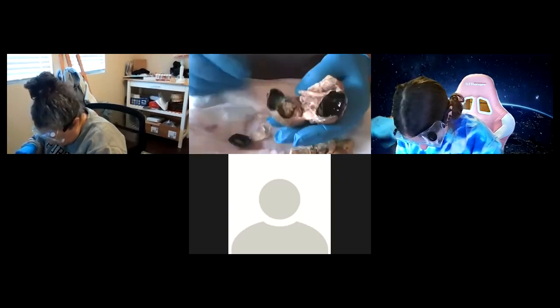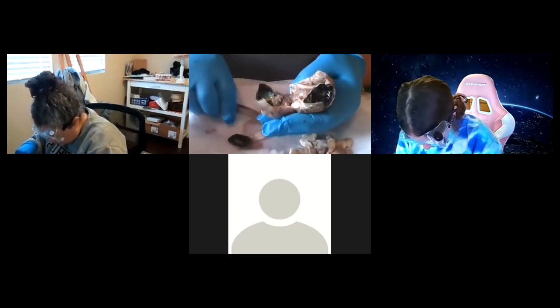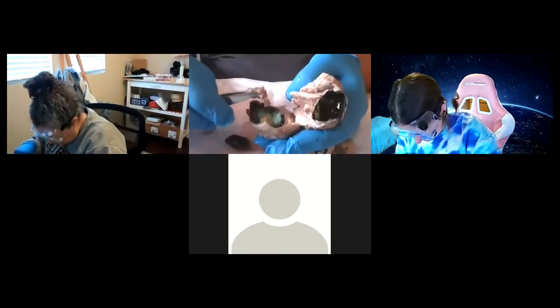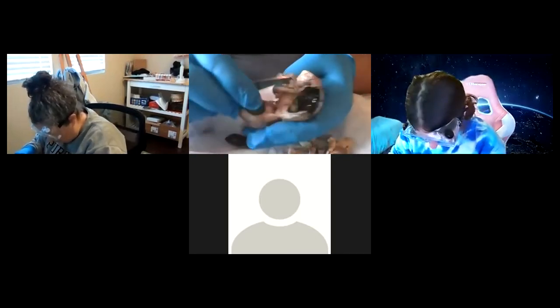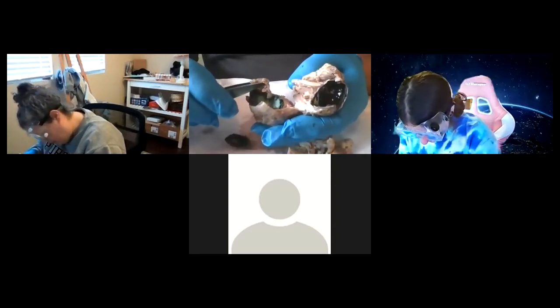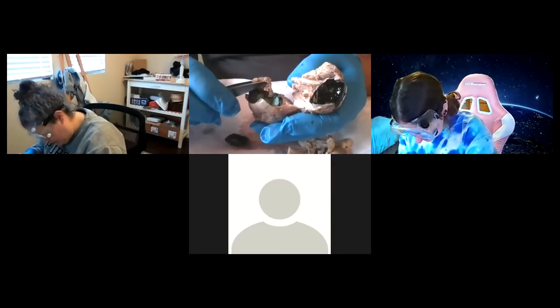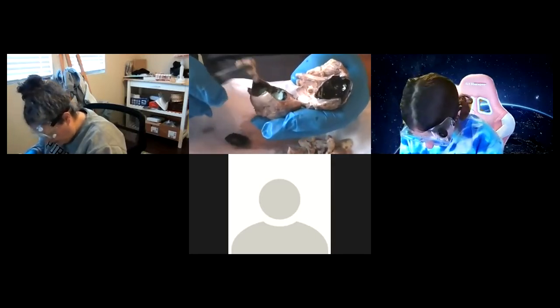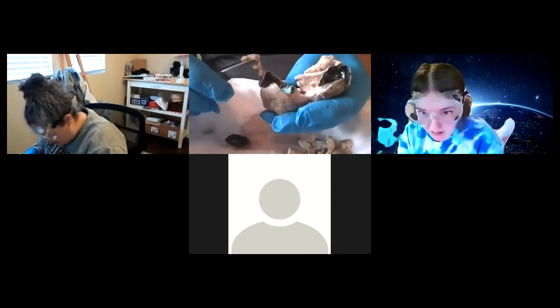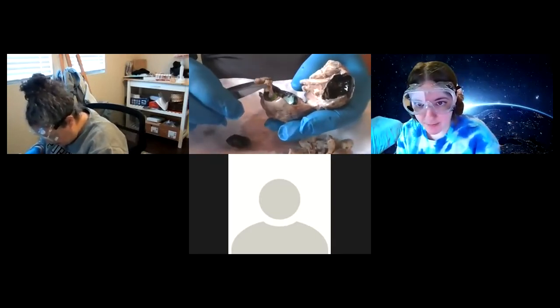Now we're inside the eye. The innermost layer — I messed it up a little bit, but it's not hard to do. This is the retina, and it lines the whole cavity. The innermost layer is your neural layer — this is your nerve tissue. This is where your rods and cones are, which are photoreceptors. That's really important.